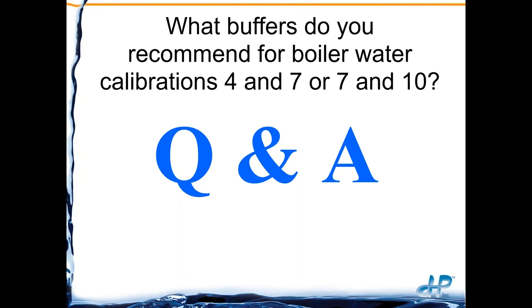Next question we have is, what buffers do you recommend for boiler water calibrations, 4 and 7 or 7 and 10? Again, we say do the 7 first because it's 0 millivolts, then do the 4 because it's the most stable, and then just spot check with the 10. And then that's where if you were off and you wanted to compensate to 10, you could do a 1-point, and that's essentially doing a 3-point process cal. But we just say 7 and 4 and then check.